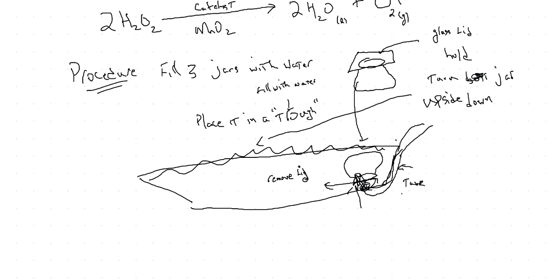Okay. Now in this tube, right? This is going to come to a jar. And on the bottom is our manganese dioxide, MnO2.